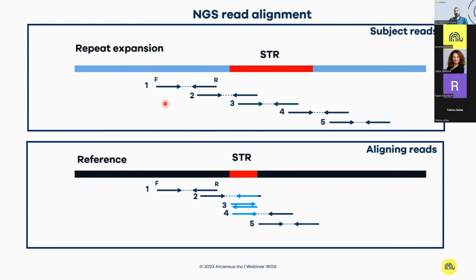So usually when you do whole genome or next generation sequencing, you first fragment the DNA, which eventually is sequenced, and the sequencing fragments that are obtained have a specific size, which is mainly around 100 to 150 nucleotides in size.